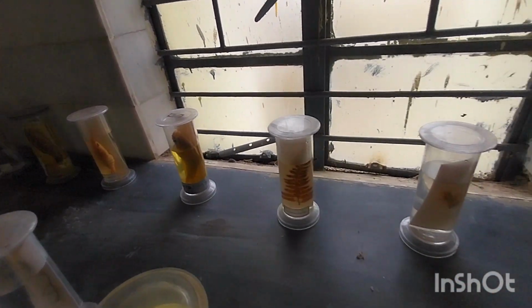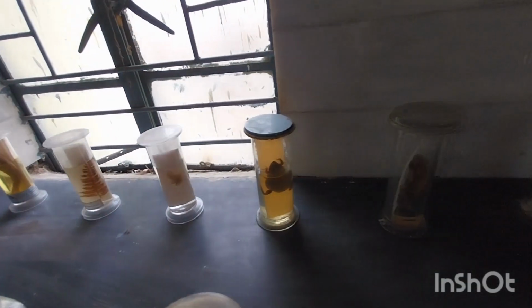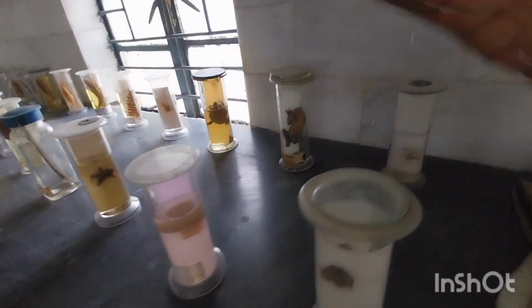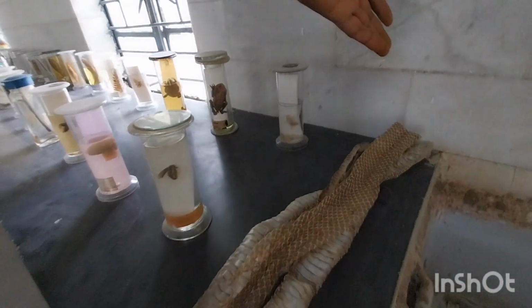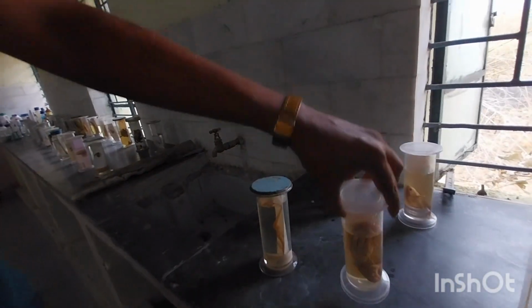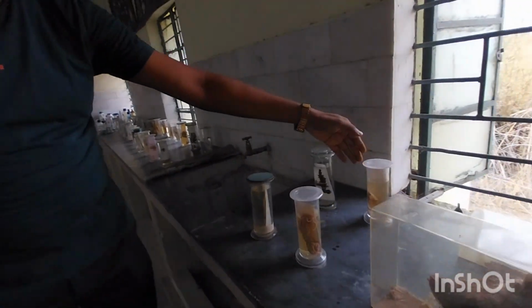Different type of specimen, frog here. Okay, here starfish also here. This is the starfish, and here we also collected this skin cast of the snake. Here you see octopus. All of you know octopus. This is fish, Anabas.